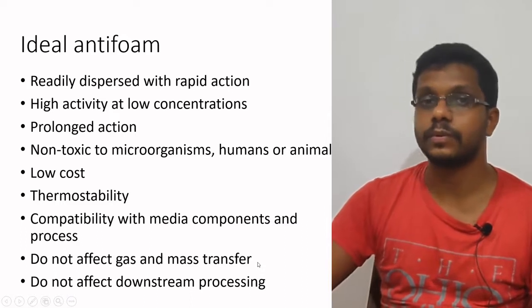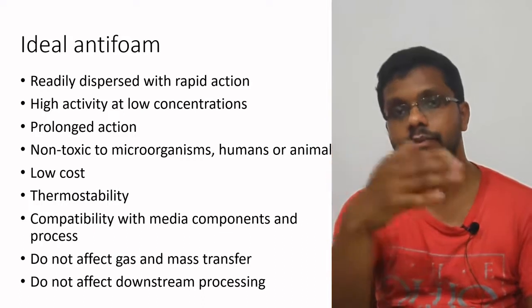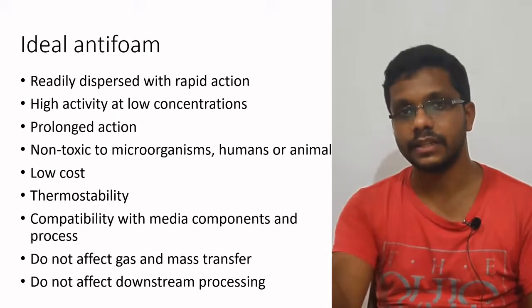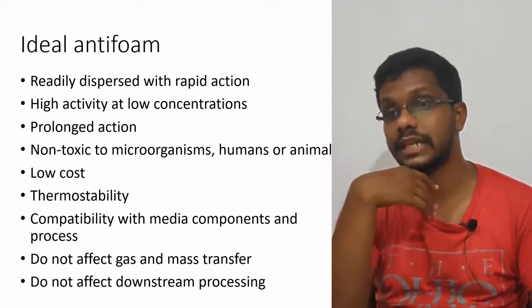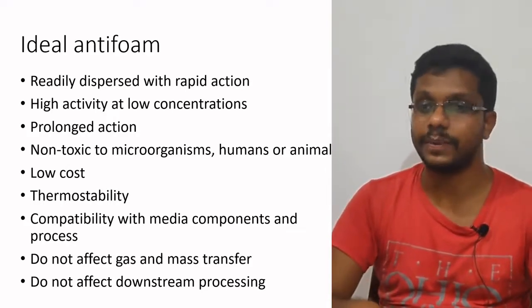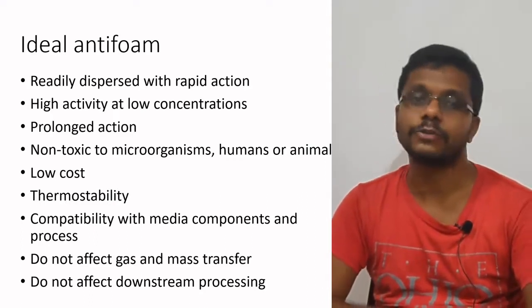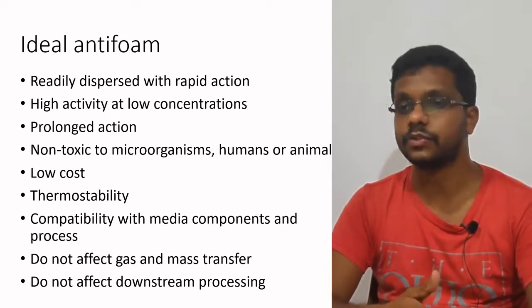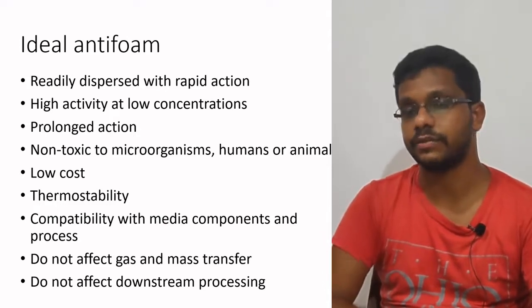Sometimes if you add some good antifoam agents, they prevent the formation of the film, but they also prevent gas exchange. The smooth passage of air through the medium will be affected, or the dissolved oxygen level may be affected. That's not ideal for an antifoam agent. It should not affect gas transfer and mass transfer, and it should not affect downstream processing, the purification of the product. The antifoam agent should be easy to remove, otherwise it will interfere with the downstream processing and the purification of the product.